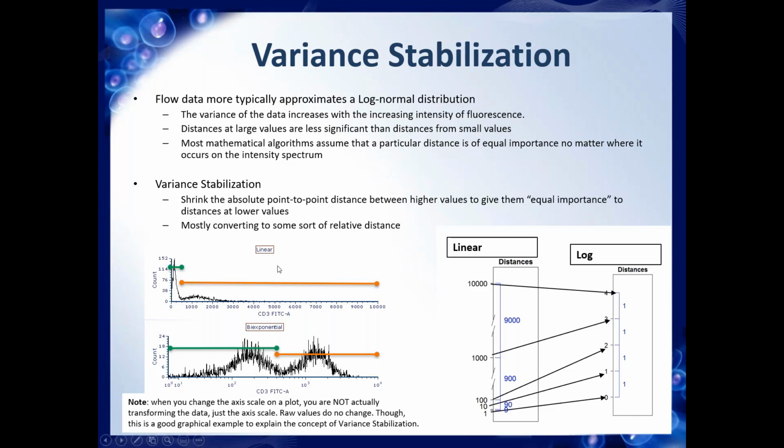So you can clearly see that if you're working with this type of data and you compare distances within the positive population and the distances that you have calculated within the negative population, you're comparing apples and pears. While if you apply a scale, you make those distances more homogeneous. You can see the green marker and the orange marker. Now you are comparing apples with apples.